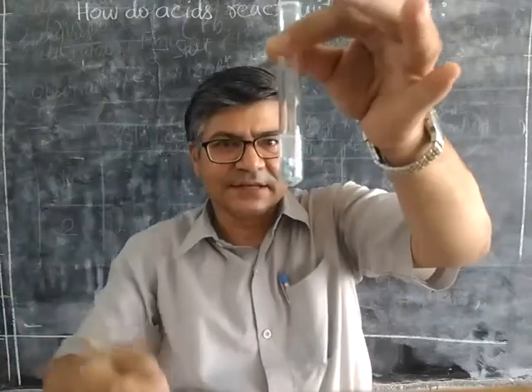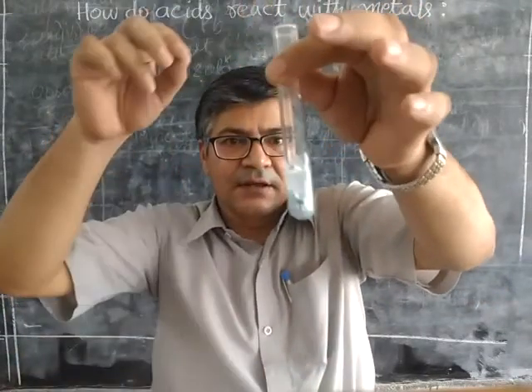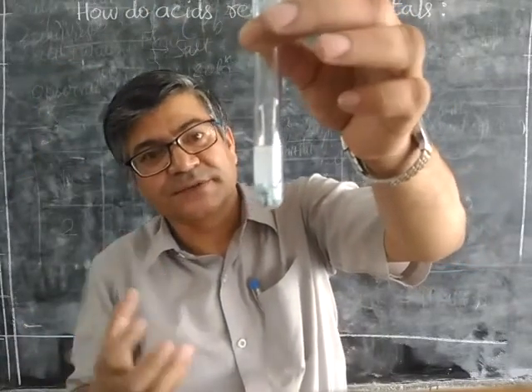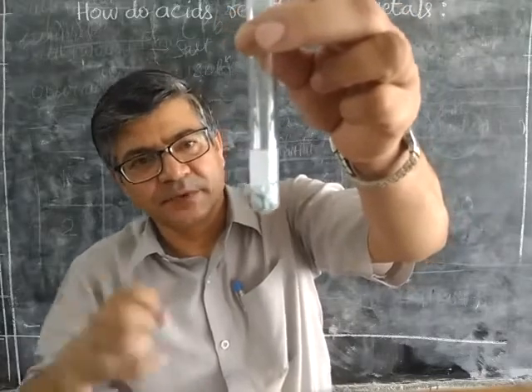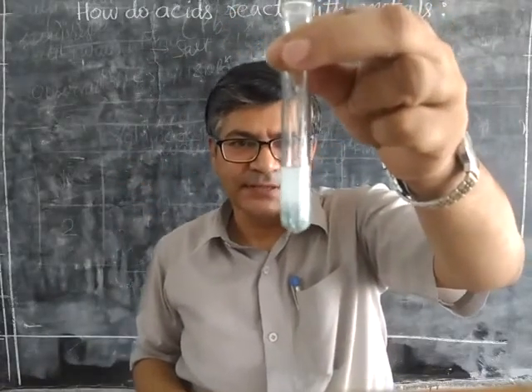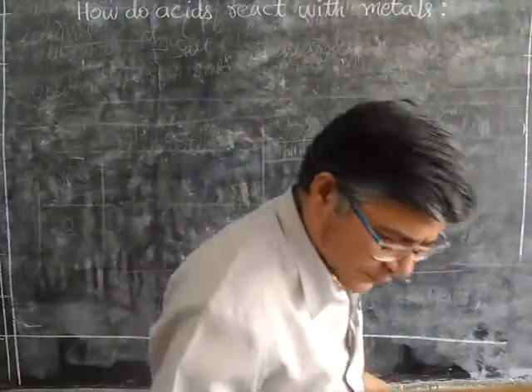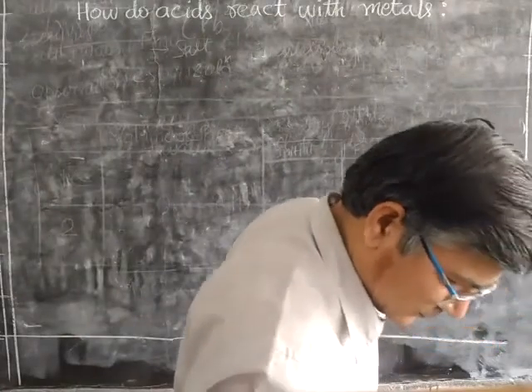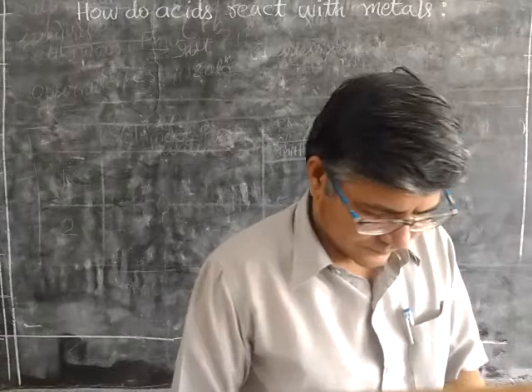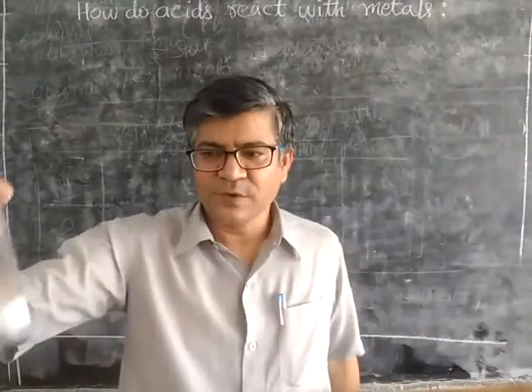Now the reaction has started. You are seeing bubbles coming out of the acid, or rather from the surface of the metal, where the reaction is taking place. Let's wait for some more time. I just heard the sound of one more reaction.